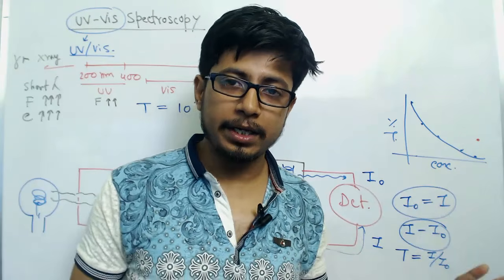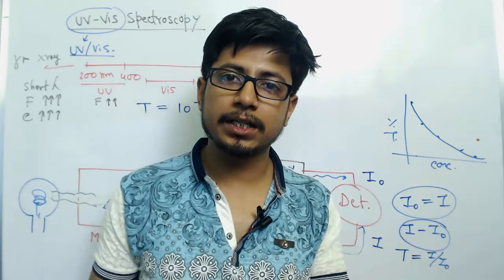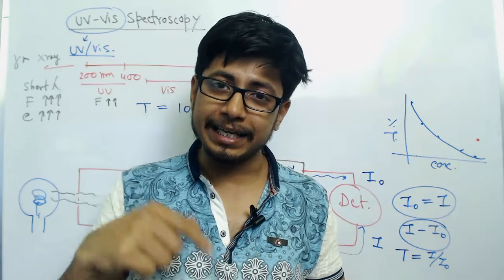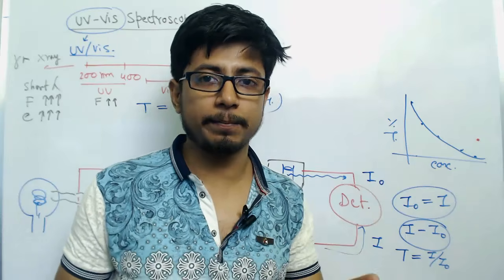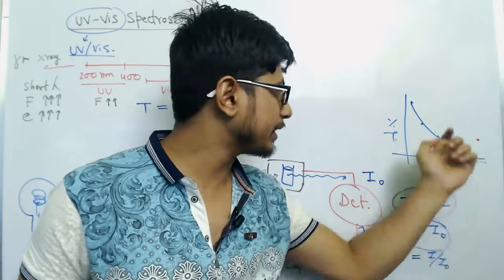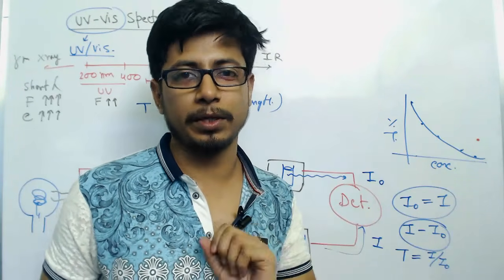Normally in the lab, if we are checking a protein concentration, we first prepare standard concentrations of proteins, the concentration of which we already know, and then we plot the data with it, a straight line. Then for the unknown sample, whenever we get the absorbance, by putting it on the data, we can simply extrapolate to find the actual concentration of that protein.